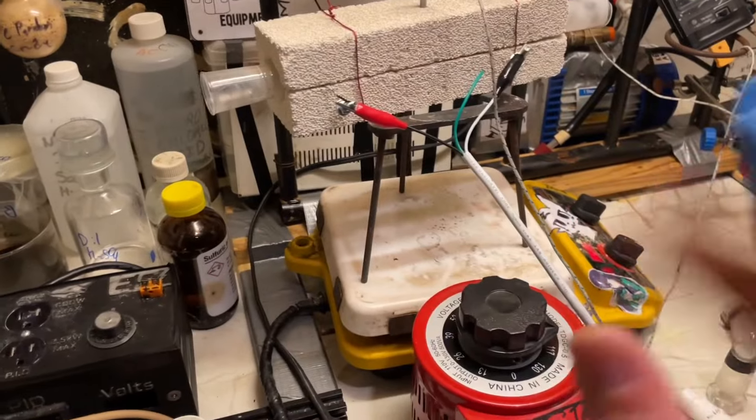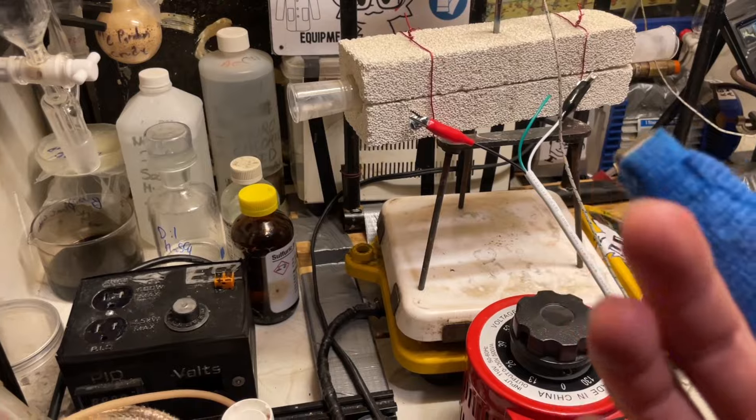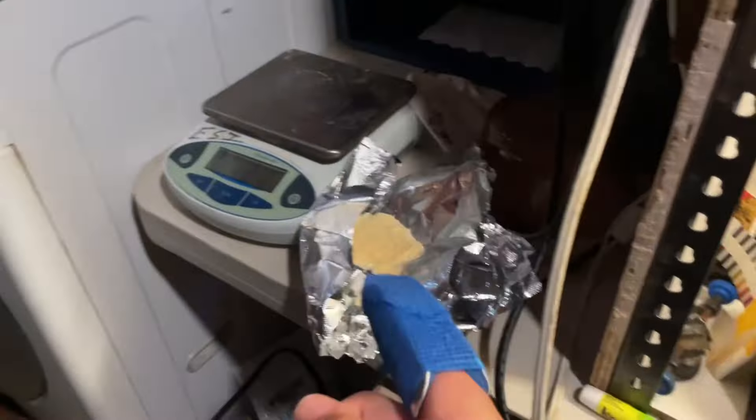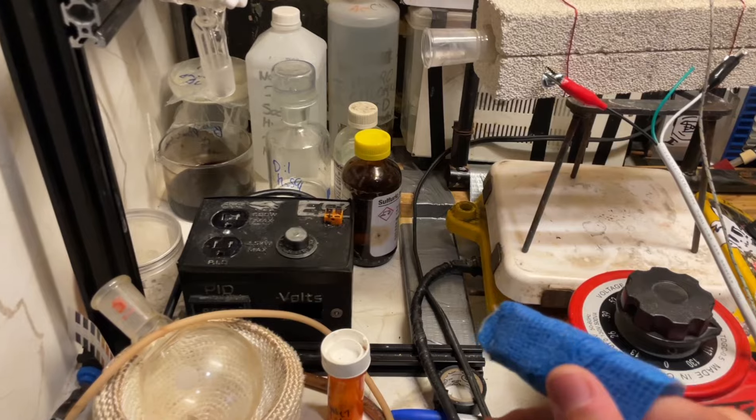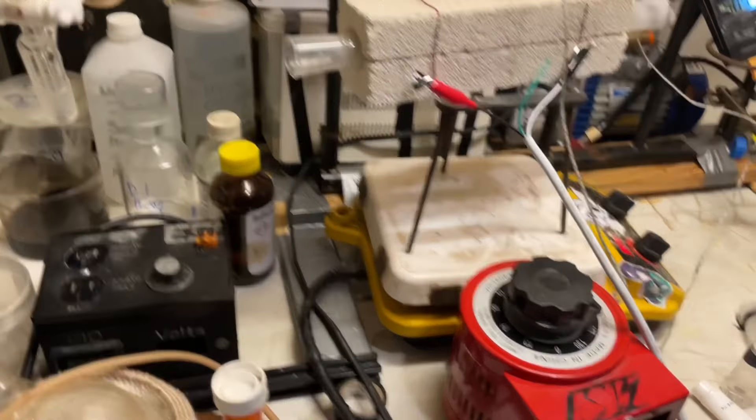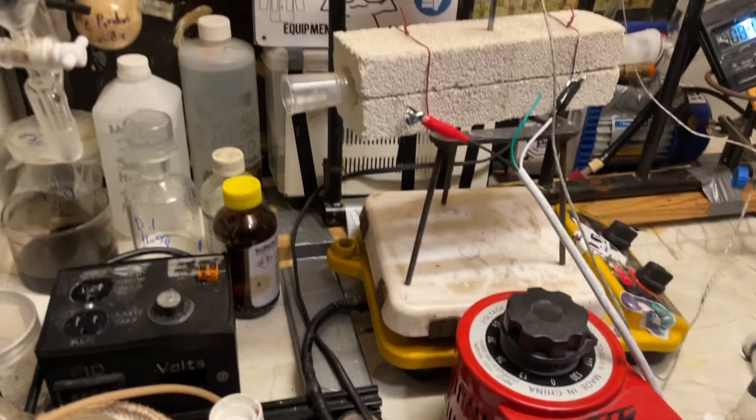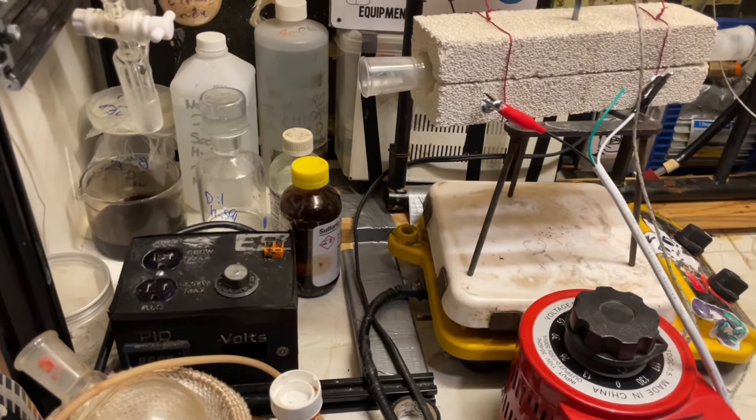I have to manually comb through all of every piece of file garbage in the gallery app on my phone. So yeah, I should get a real camera. But that's for the future. I hope you guys enjoyed this video. And I was gonna do other oxidation methods of that, such as just using bleach. But yeah, I'm lazy and this works fine. I don't know what to do with the biurea, though. It's kinda useless as a chemical. So when I do make the bread video, I think I'll show off some other methods of oxidation.